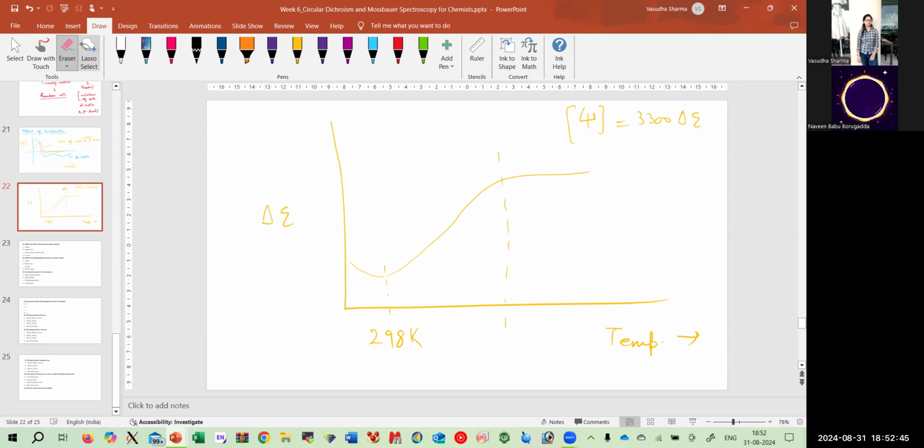Or the melting curve. You can easily see that in this particular structure you're getting a peak at 195, also one peak at 208, similar to that of your positive alpha helix, but a broader peak again here at somewhere around 222, not reaching 230. That could also be a possibility of having a mixture of alpha helix and beta sheet, which we can easily define from the CD spectrum.